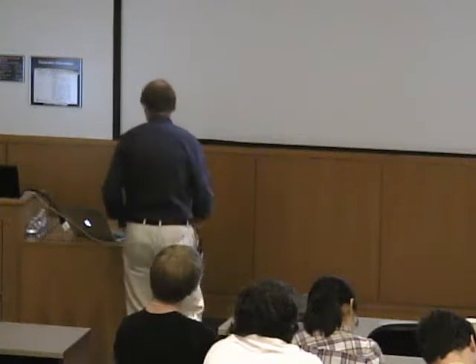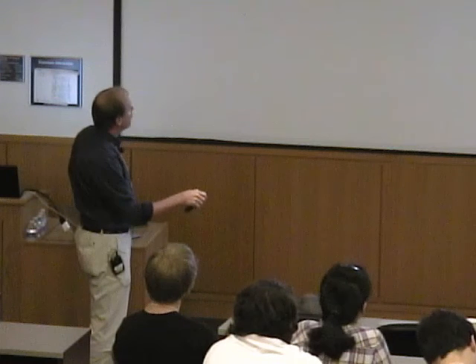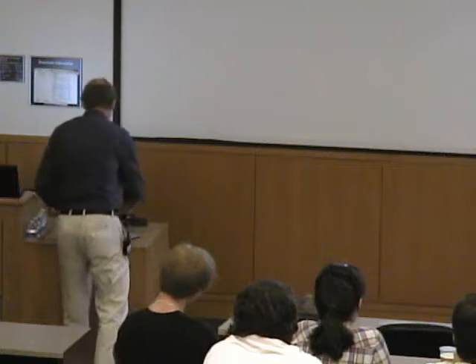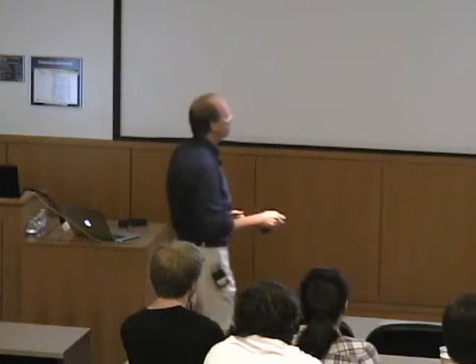So if I were to take my amplitude, so here I've shown it as being much smaller than the width of this line, but if I take my modulation now and make it bigger than the line, so we're oscillating back and forth across the whole line, then this sort of thing starts to happen, and the width of the line that you observe in the spectrum becomes bigger, right? And we actually use this to calibrate the modulation amplitude, the amplitude of the modulation field in the sample, by taking a standard like this.